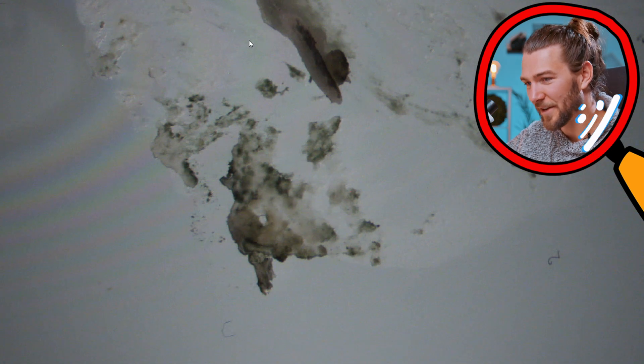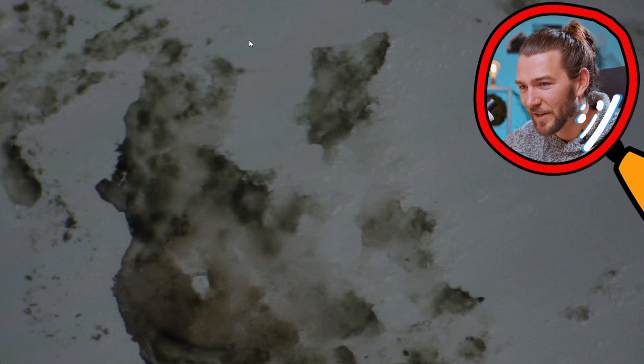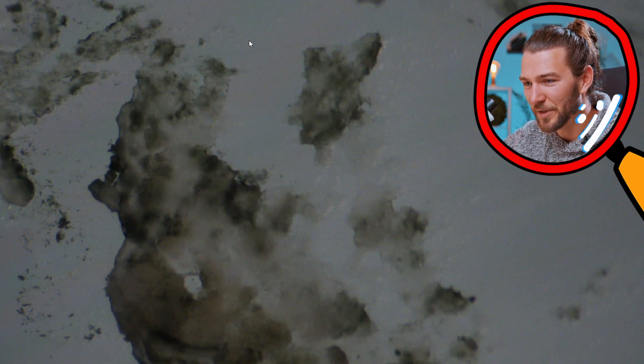So now we've got the mold on the glass slide here. With this microscope we can zoom up to 200 magnification, or 220 magnification, and see how it looks like. Here we're on 100x. You can see these little mold spots and cheese in between. Let's zoom in a bit more up to the maximum.